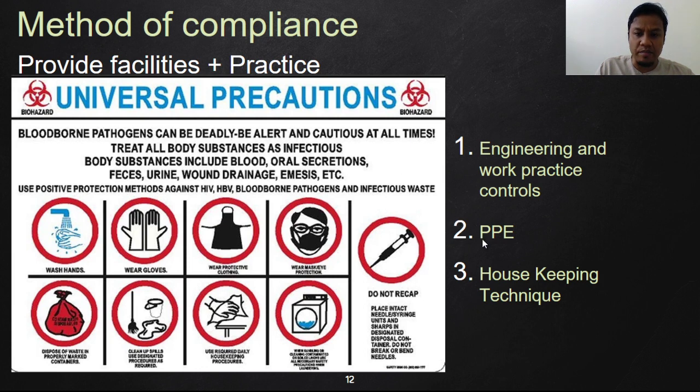Second, by providing PPE, personal protective equipment, for staff, following the biosafety needs. There are 4 levels of biosafety, so the PPE must match the levels of biosafety. And third, housekeeping techniques. This is to maintain the work site in clean and sanitary conditions.